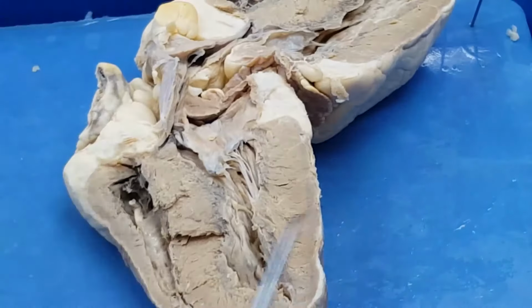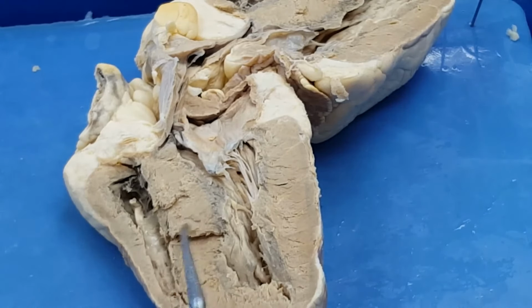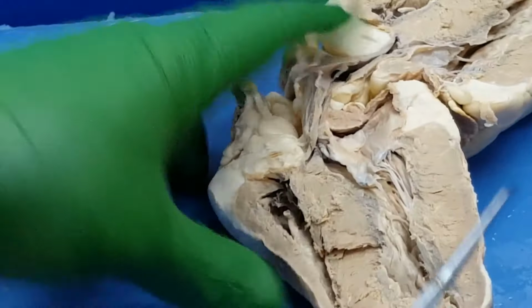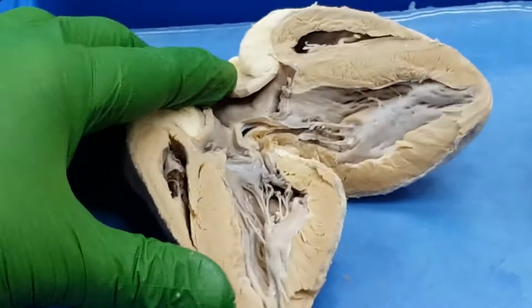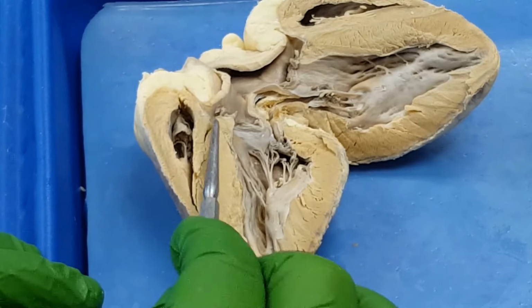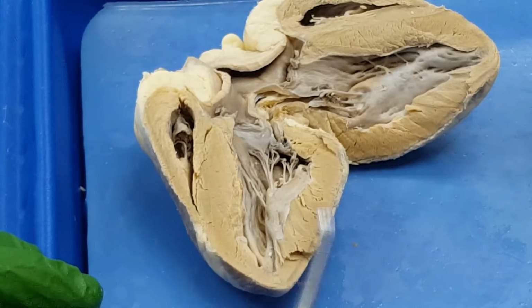I can also notice here, between the two ventricles, this interventricular septum. Right here. This one's shredded a little bit here and here. That's just a remnant of my dissection. Here I can see it a little cleaner in this smaller heart. Interventricular septum. Right here.